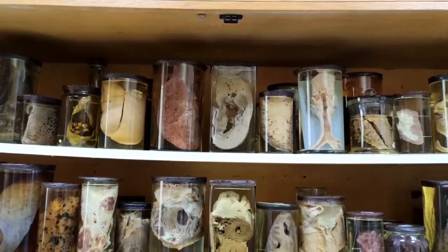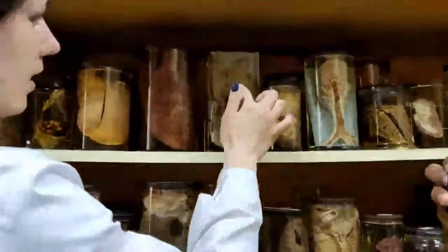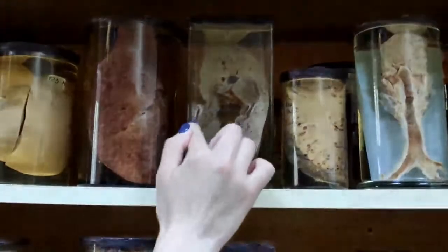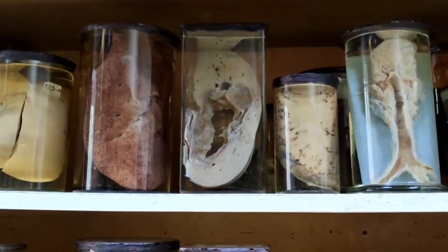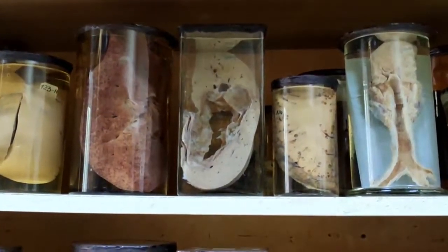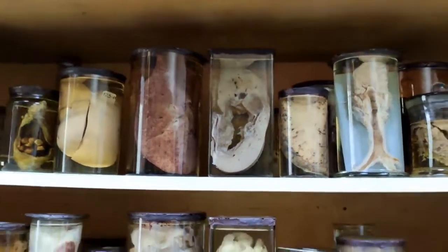So usually in Echinococcus the patient has multiple cysts. So this is the liver, and this is a cyst, and we can see a lot of so-called daughter cysts or secondary cysts in one big primary cyst. So firstly we have a primary cyst and a lot of secondary cysts inside. And of course the parenchyma of the liver will be under pressure. This is why we can see atrophy of the liver parenchyma which surrounds this cyst in Echinococcus.